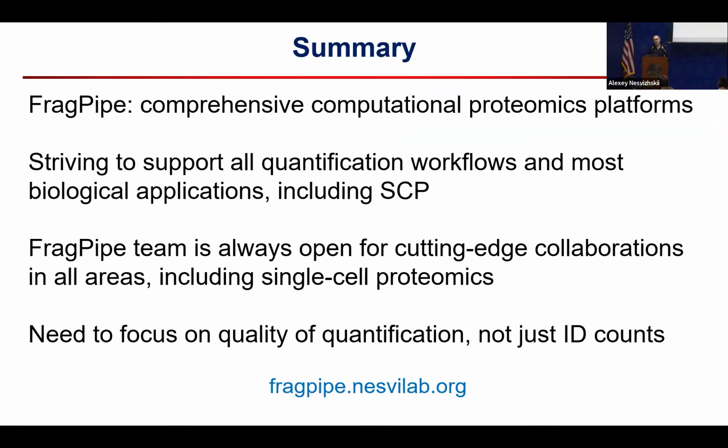Great talk. I'm a huge fan of MS-Fragger open search. I know you didn't talk much about it, but I have a question on one of the things you mentioned. You said that you throw out identifications if you don't find a precursor. Do you have a sense of what proportion of the time that's happening?